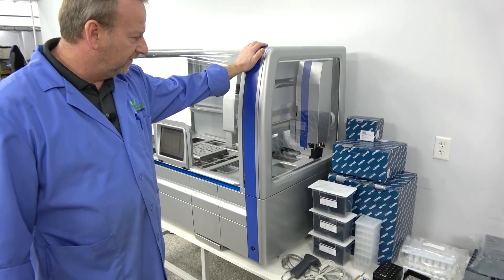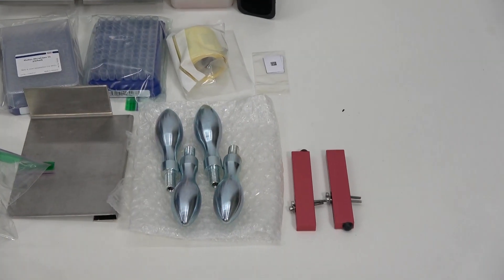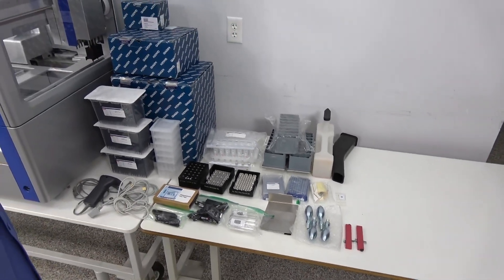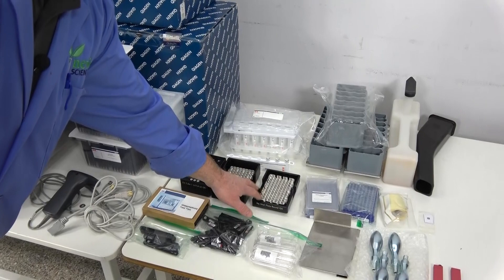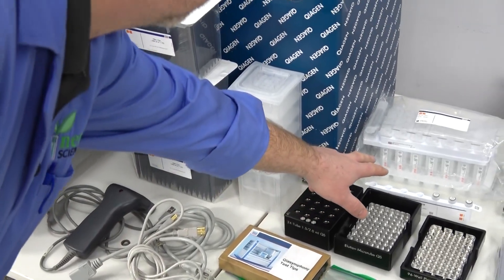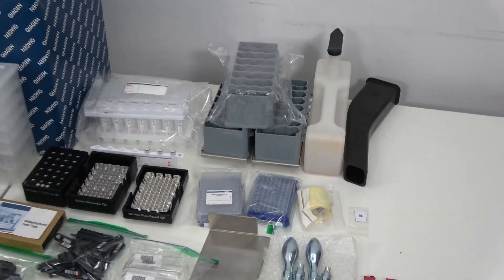We do have a few consumables and some of the handles over there. I want to point out these robotic blocks that have to be installed for shipping — those will be installed and will need to be removed and saved for later, so keep that in mind. Over here you can see different tube holders that go in the cooler in the back. We also have a barcode reader, some cartridge kits, an extra waste bottle, and an extra waste chute.